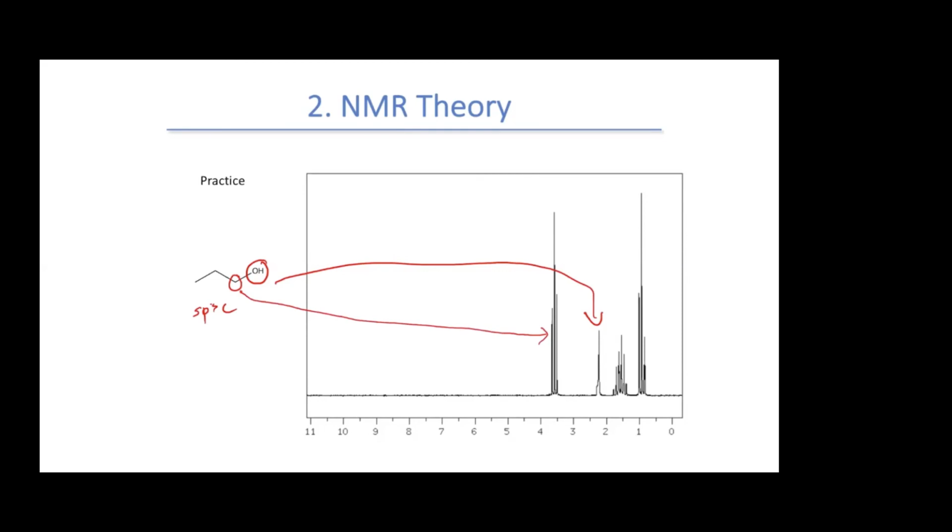And then we're going to look at our peaks for CH2 and then our CH3. The CH2 has more substitution on it versus the CH3. That means it's going to be a little more deshielded. So that CH2 group is going to be that peak. And finally, the CH3 will be our most shielded peak, closer to 1. So again, you can see we can identify all the peaks just by knowing the regions and knowing the trends of how the shifts happen.